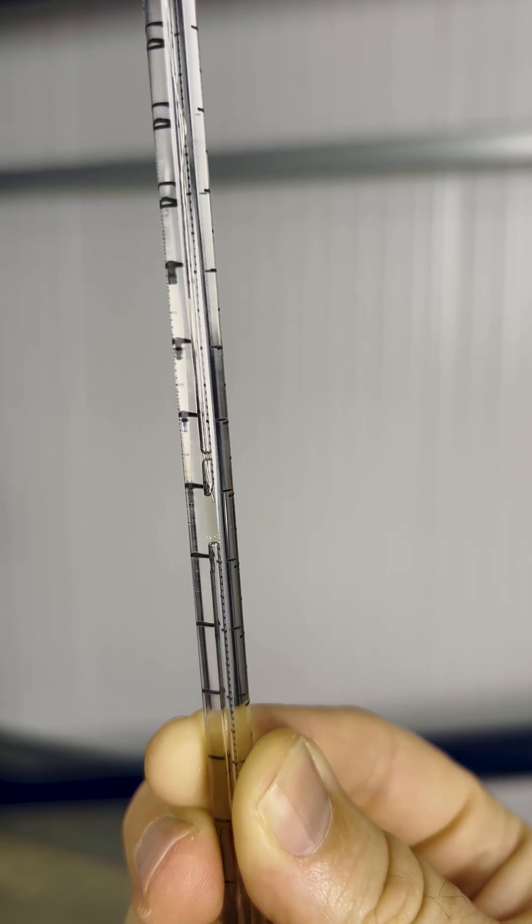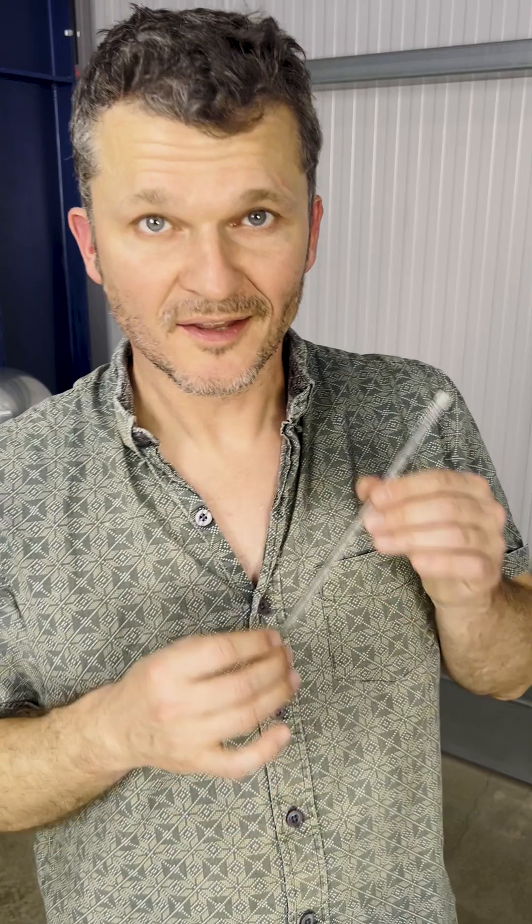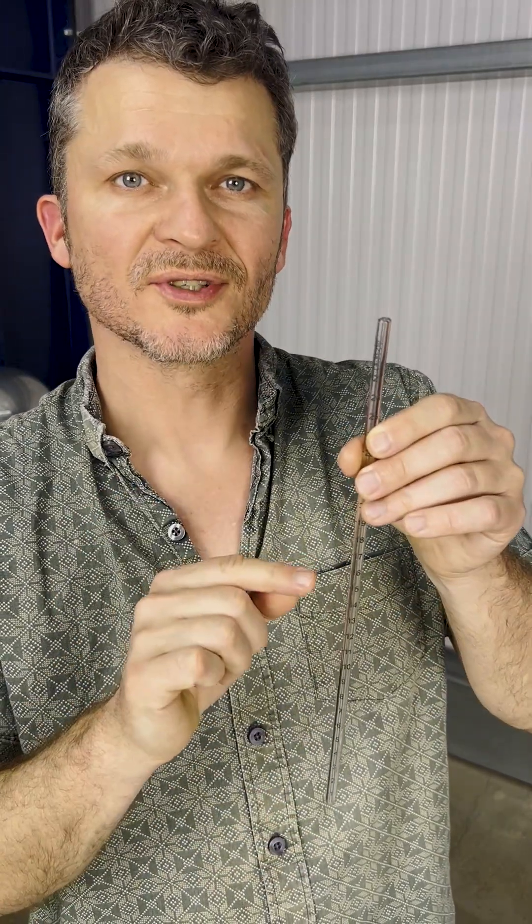The oil will follow the wire down and form wherever the end is in the tube. You can even fix a broken bead if you bridge the gap gently. And that is how we get a bead of oil right in the middle of a Charles Law tube. Now all you have to do is warm it up and watch it move.